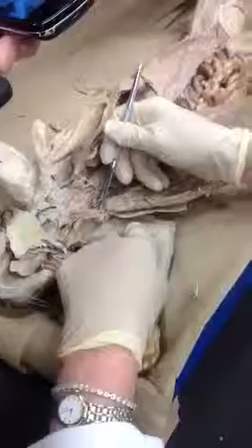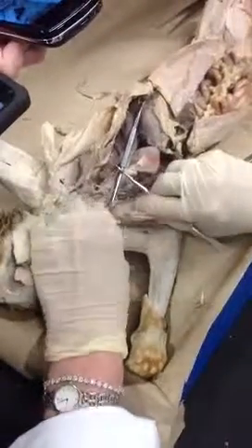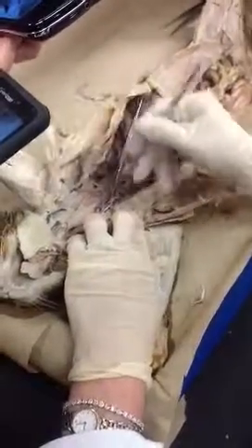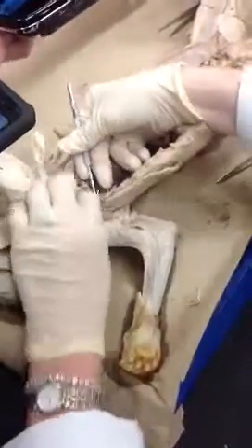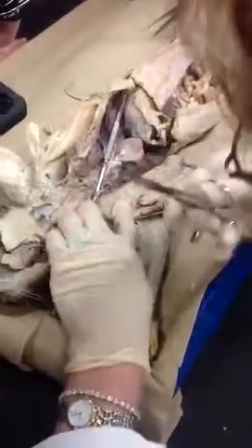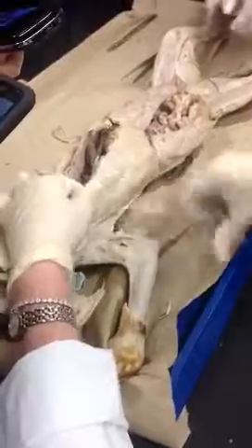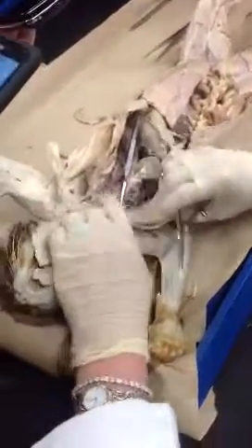Now what we want to do is get to the upper arm. So what you're going to have to do here is kind of see where it's going. And we don't really care about the veins because we're going to do the veins on this side. And we don't want to cut through it, but we want to cut through over here to get to the arm. So probably the easiest way to do it is just kind of see where that artery is. Start cutting through a little of this muscle at a time so that we can get to that vessel. We don't care about the muscles anymore because we've already done those, right?